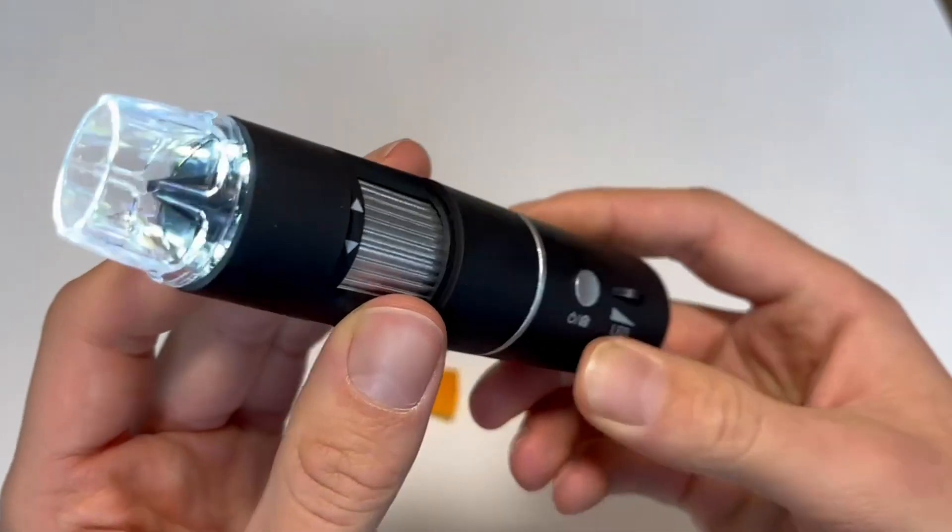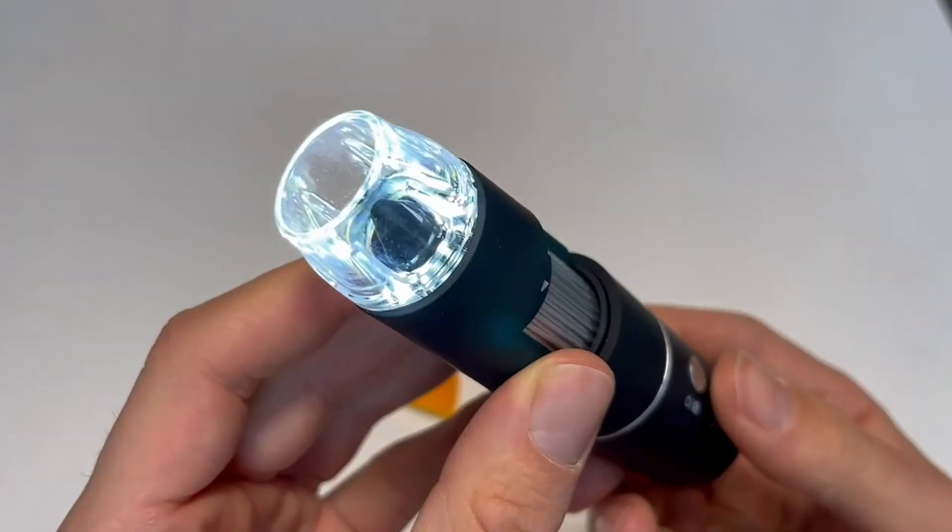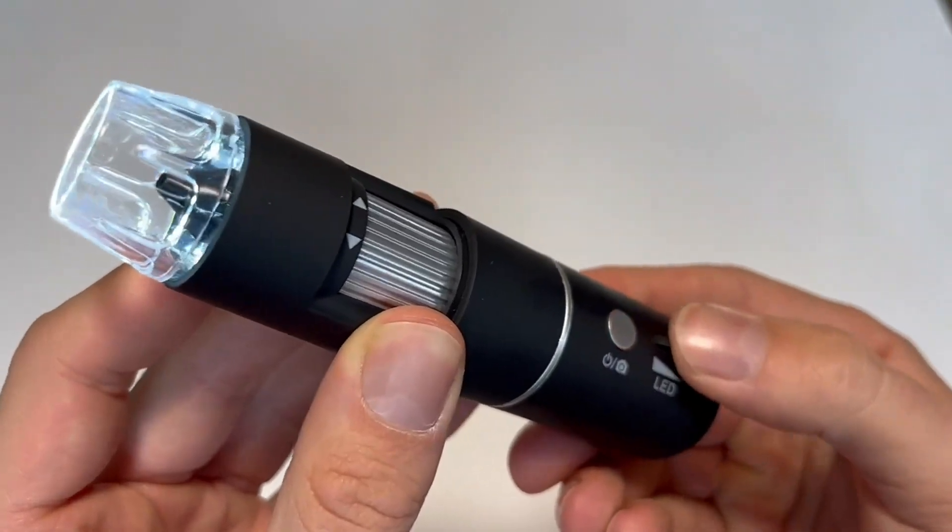So you can see to turn it on, you need to hold down the power button for a few seconds, and you do have that LED control to be able to control the light.